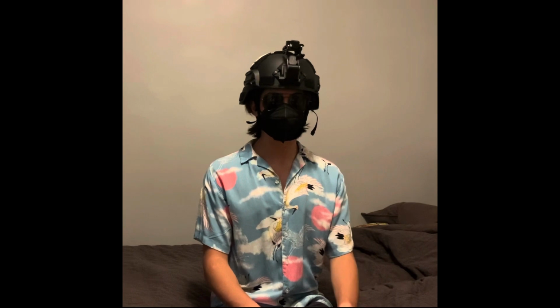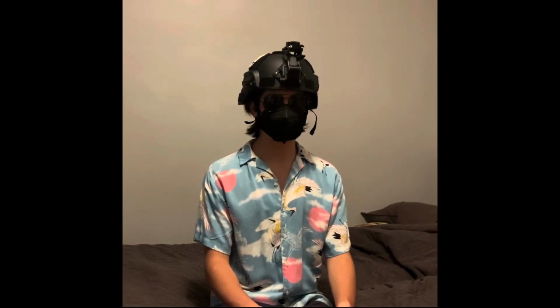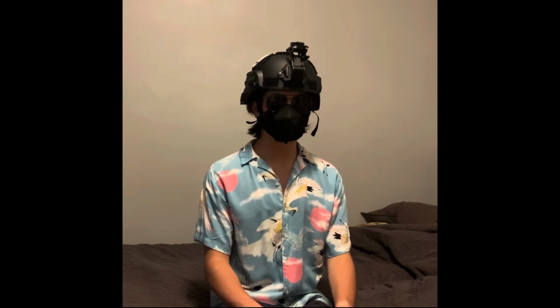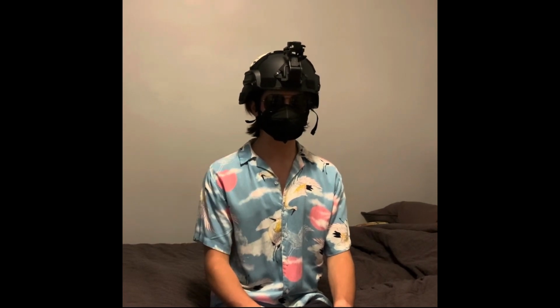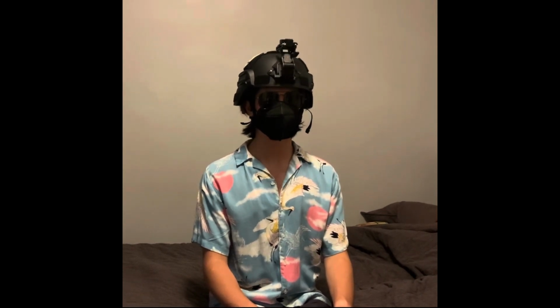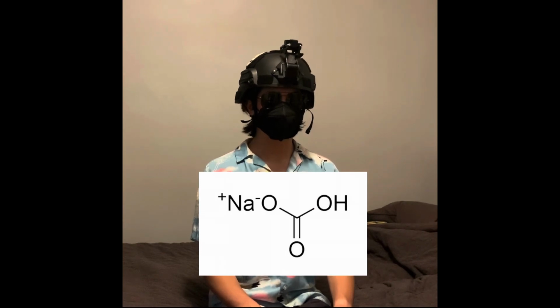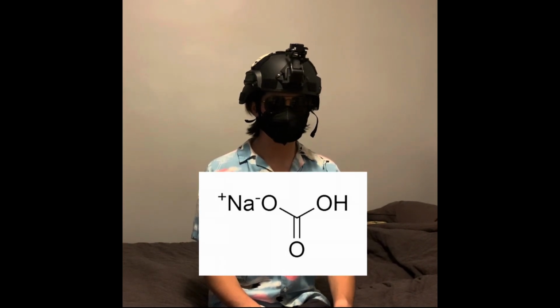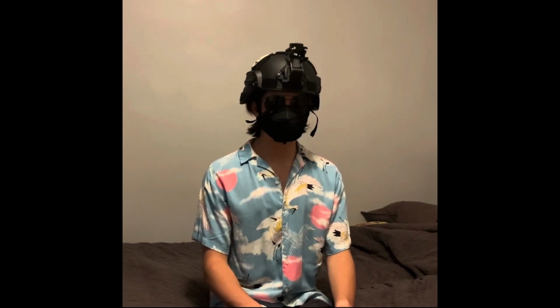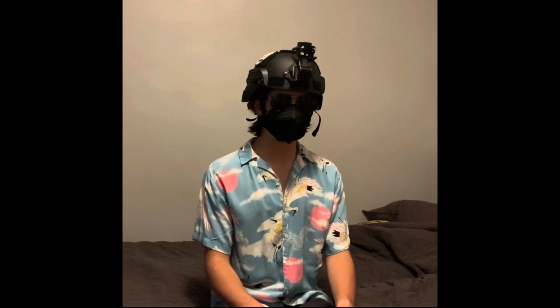For our test, we will be measuring the concentration of an unknown concentrated version of sulfuric acid that has been produced electrolytically. We will be doing this by adding sodium bicarbonate or baking soda to distilled water and creating a saturated solution. From there, this will be added slowly to the sulfuric acid solution until no more bubbling or reaction is observed. Sodium bicarbonate, made up of the bicarbonate ion and the sodium ion, is something known as an alkali salt, where it dissociates completely into a solution and creates 1 hydroxide ion per 1 mole of sodium bicarbonate.